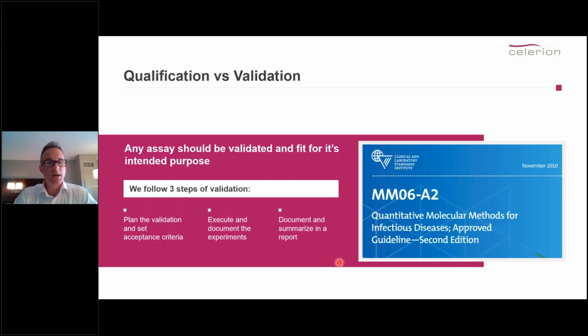tissues or areas. Now, when it comes to qualification versus validation, as I've already mentioned, I find that sort of statement a bit problematic, and I think, probably from the discussions that we've had in the industry in general, probably a bit outdated. Qualification is less and less used these days, and you talk about validation, but more like fit for purpose validation. But it's still a validation nonetheless.